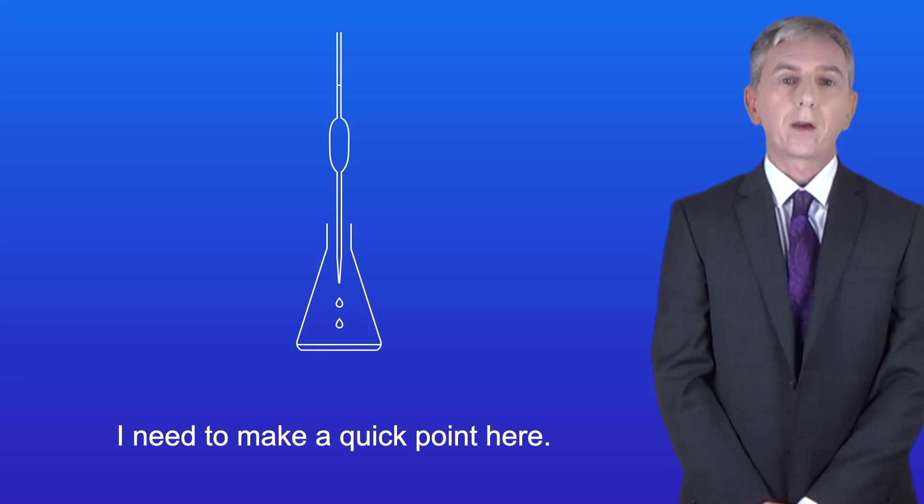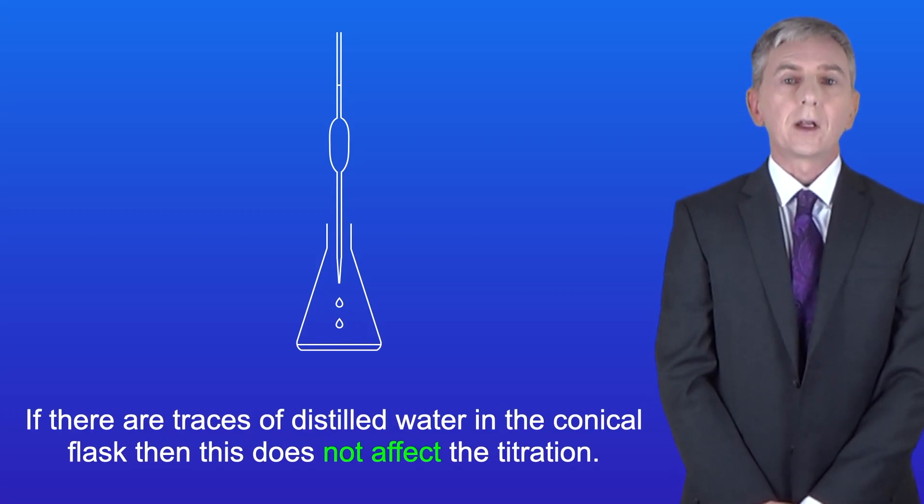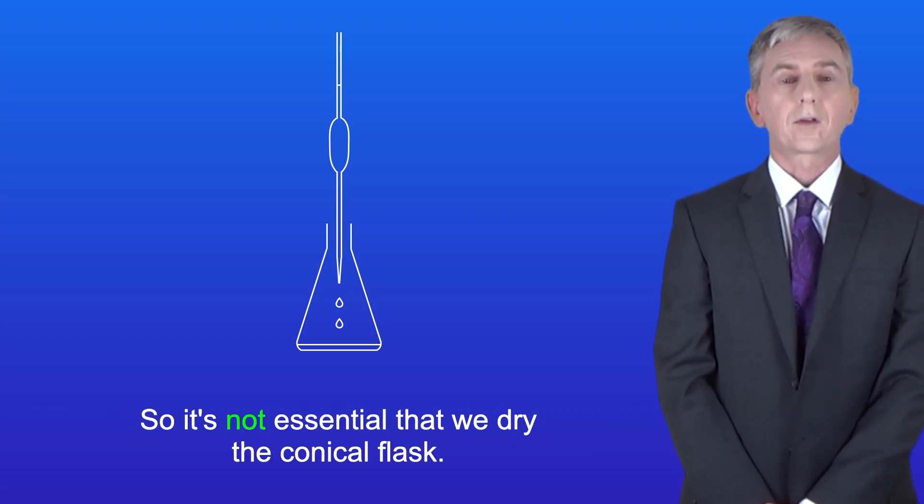Now I need to make a quick point here. If there are traces of distilled water in the conical flask, then this does not affect the titration. So it's not essential that we dry the conical flask.